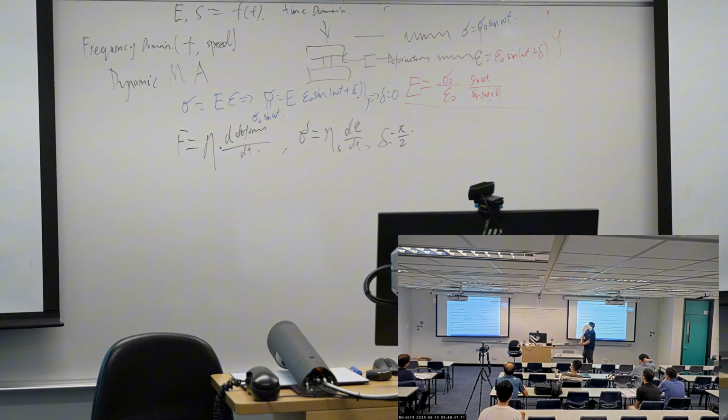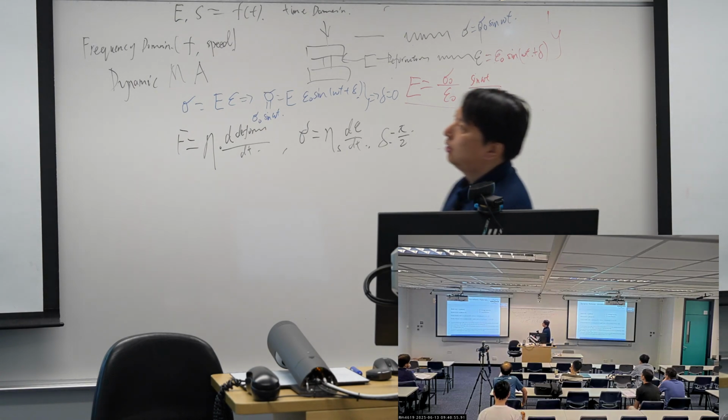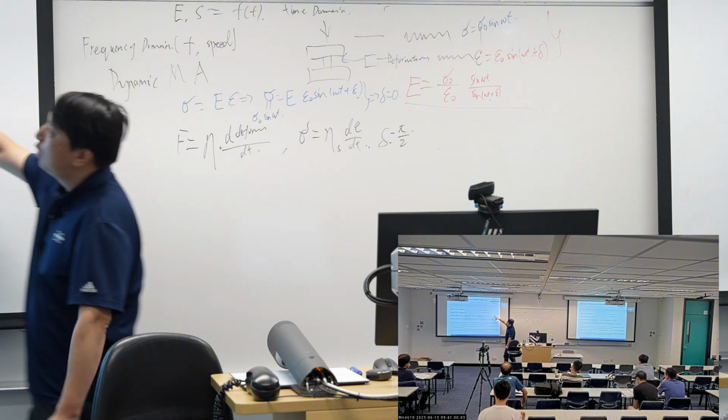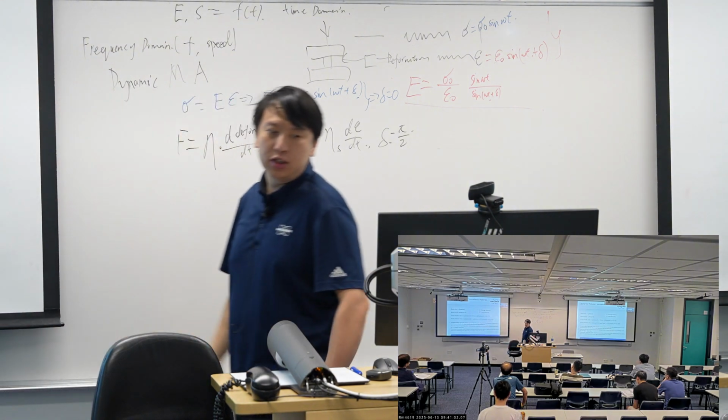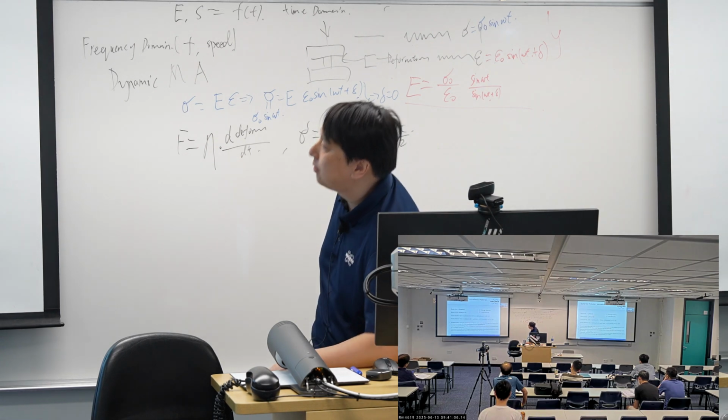So with the pure elastic and the pure fluid, people detect that the phase should be a good signature for the properties.